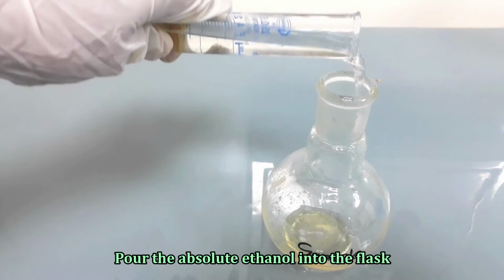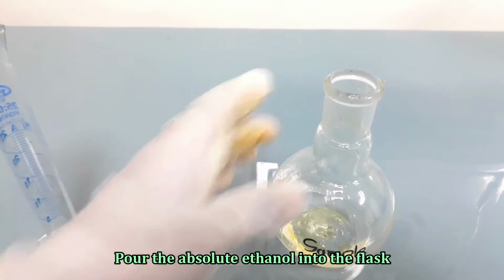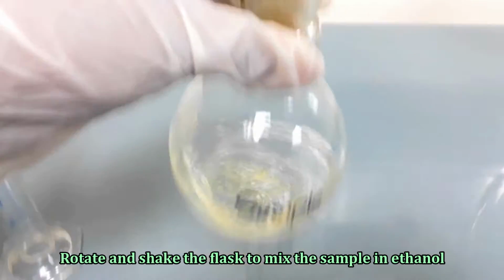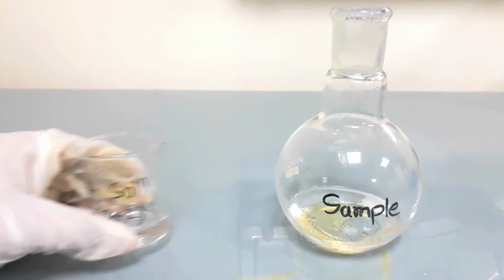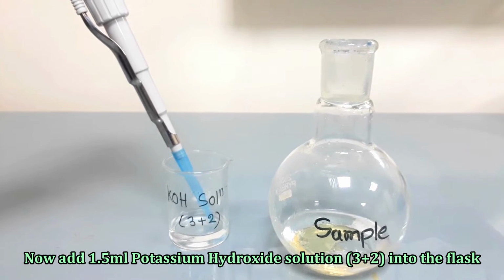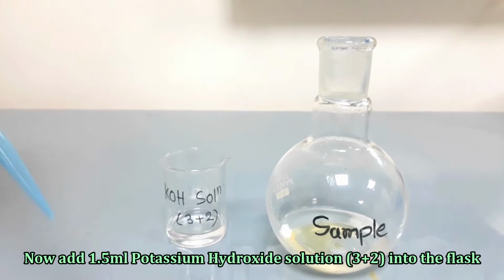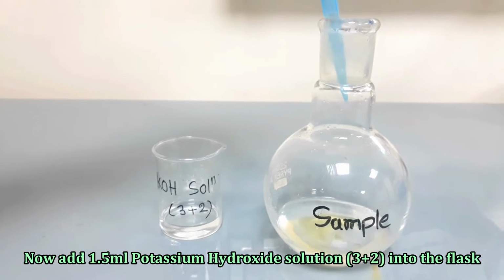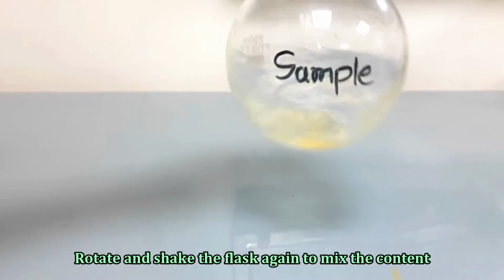Add 25 ml ethanol into the flask. Now add 1.5 ml of potassium hydroxide 3+2 solution. Shake and rotate the flask to mix the content.